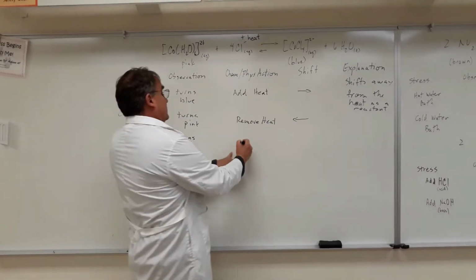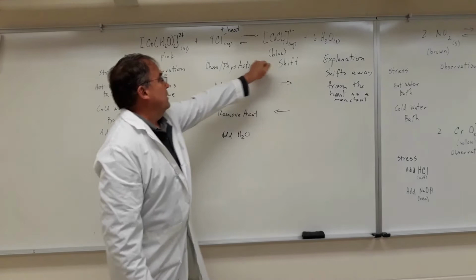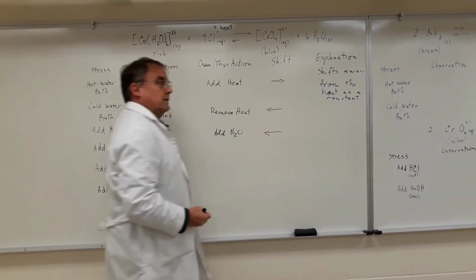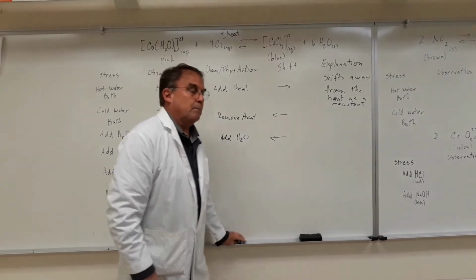Physical action was to add H2O. The shift was from blue to pink. So from product to reactant. So what did our Le Chatelier's principle tell us over here?